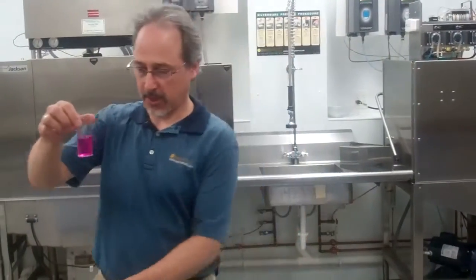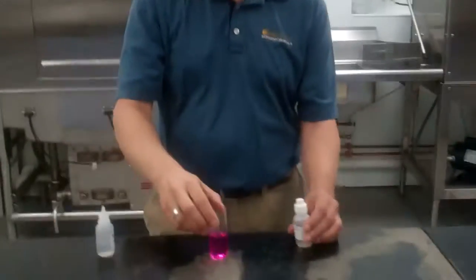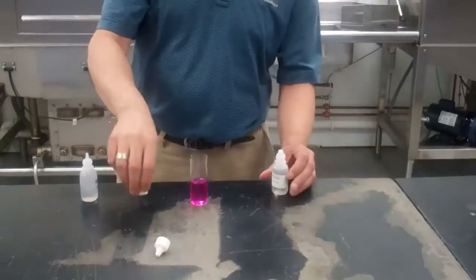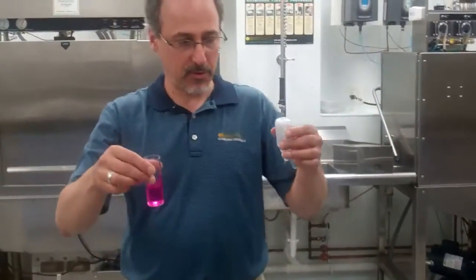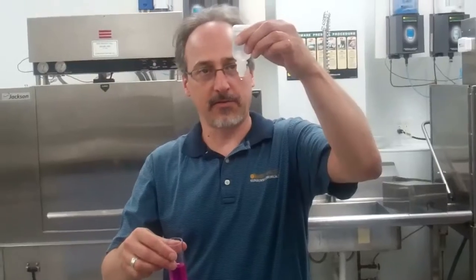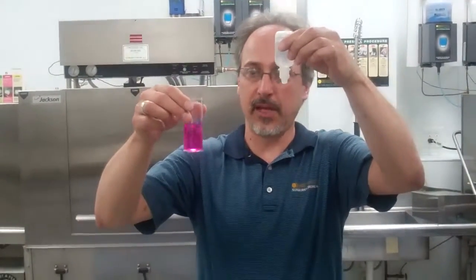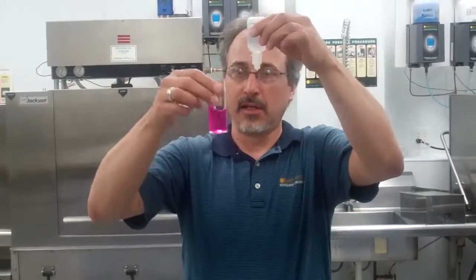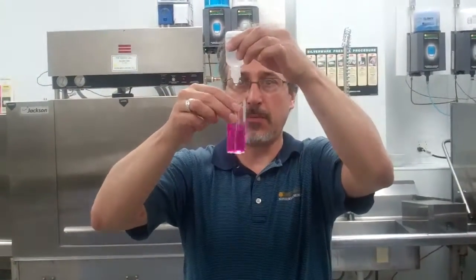Now, in order to find out how many parts per million we have, we're going to drop one drop of titrant number two, one at a time, counting the drops. Each drop will equal 50 parts per million. You want to waste the first drop. Use your dominant hand to do the swirling. I like to hold it up in front of me so I can watch for the color change, then start dropping and counting.